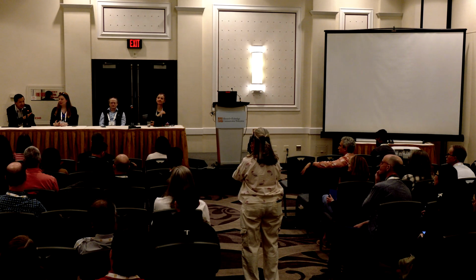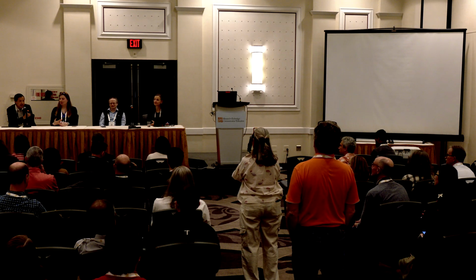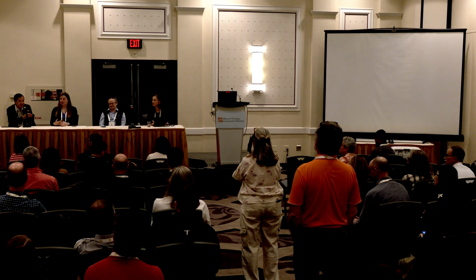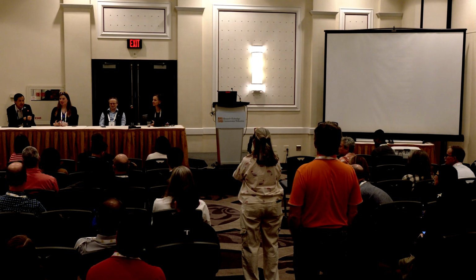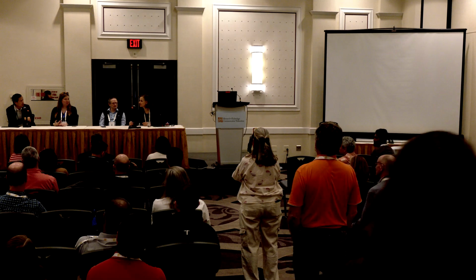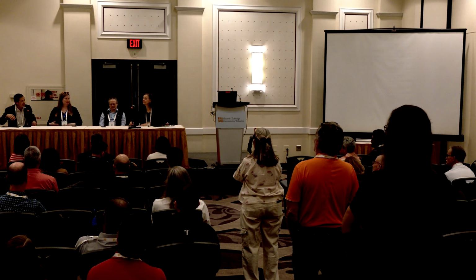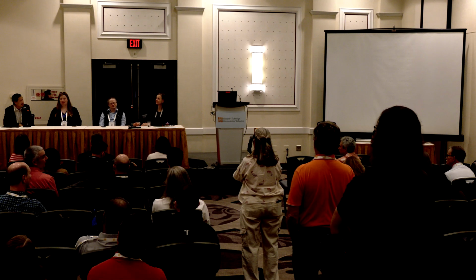I said, no, okay, calm down. You can even save metadata potentially. You have to consult your discipline, but just enough data to validate the results, and that can be a fraction of the total amount of data. Is that to validate the published results, or which results are you talking about? The final results, whatever the final results are.